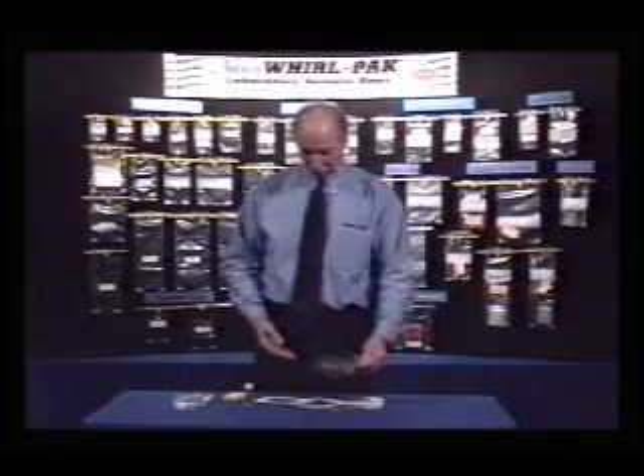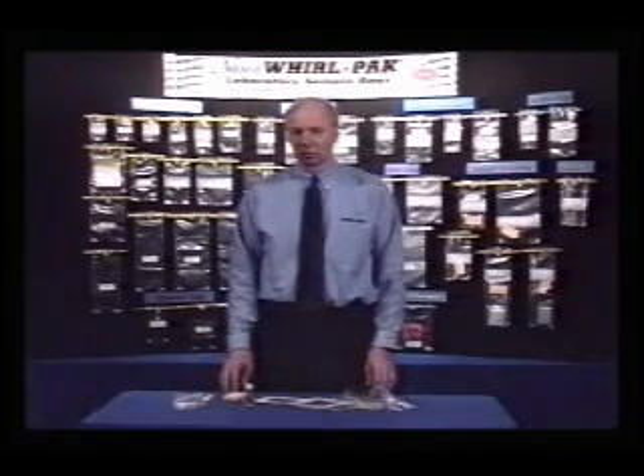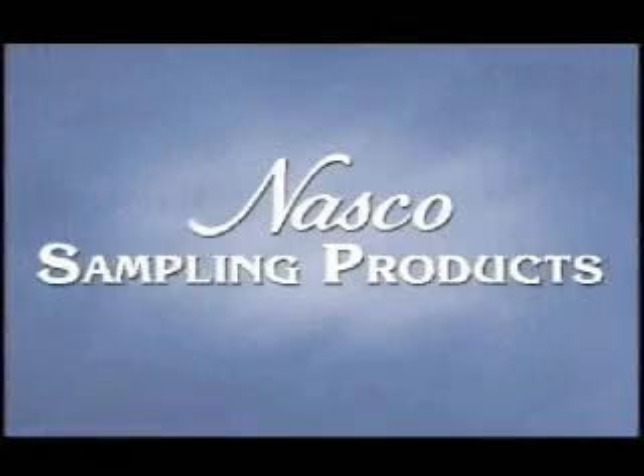The kits are packaged 25 in a box. The next section of this video will explain the various NASCO liquid sludge samplers that are used in a variety of applications.